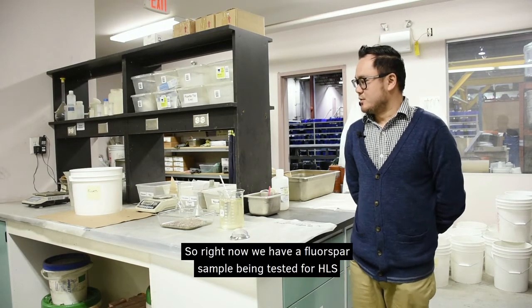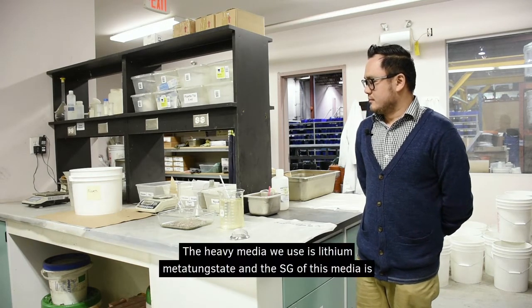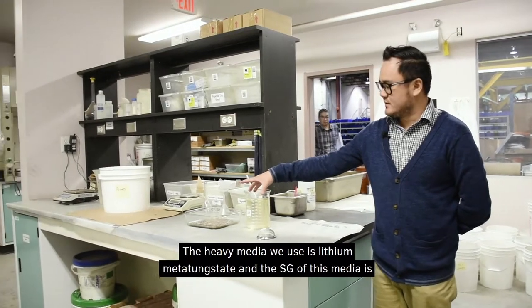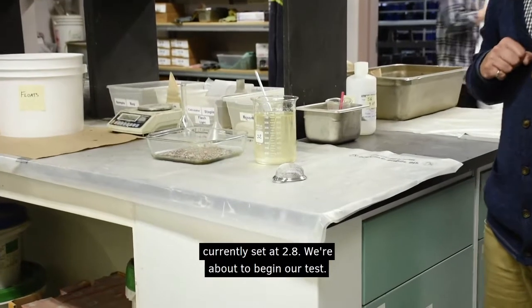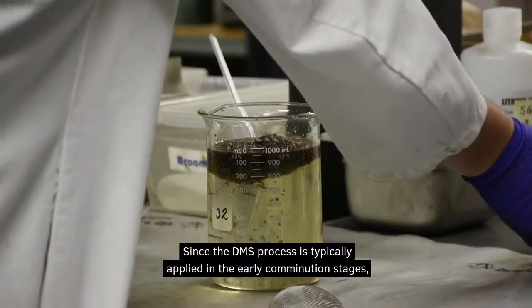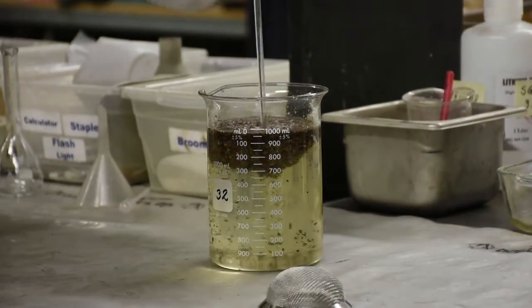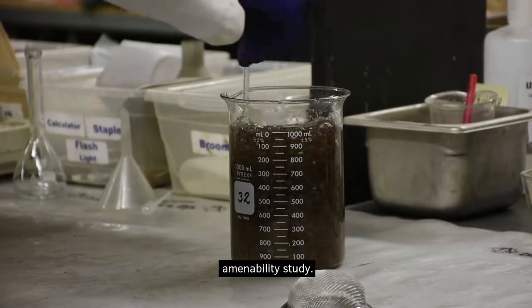Right now we have a fluorspar sample being tested for HLS investigations. The heavy media we use is lithium metatungstate, and the SG of this media is currently set at 2.8. We're about to begin our test. Since the DMS process is typically applied in the early comminution stages, the HLS test feed is crushed to a relatively coarse particle top size for the amenability study.